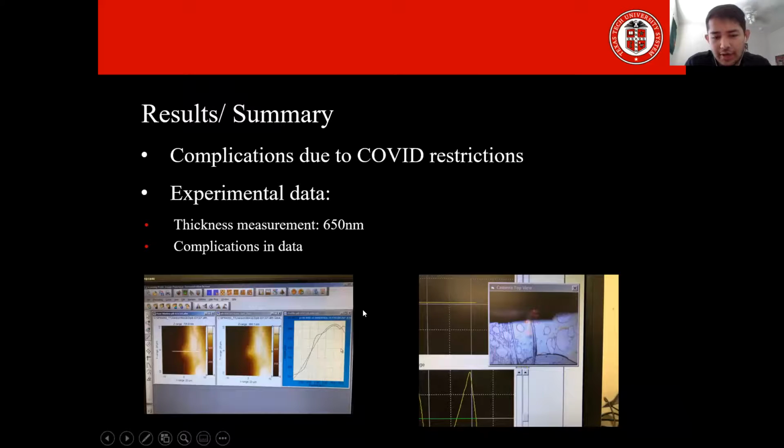there's a lot of learning here, a big learning curve. I had to create a lot of samples in order to figure out the best method. Filtration, which I talked about before, was a very big part of this project, since the first time I did it without filtering the sample, there were a lot more holes and other random dust particles in our sample when we measured the thickness. All the extra measurement comes from other unnecessary material.